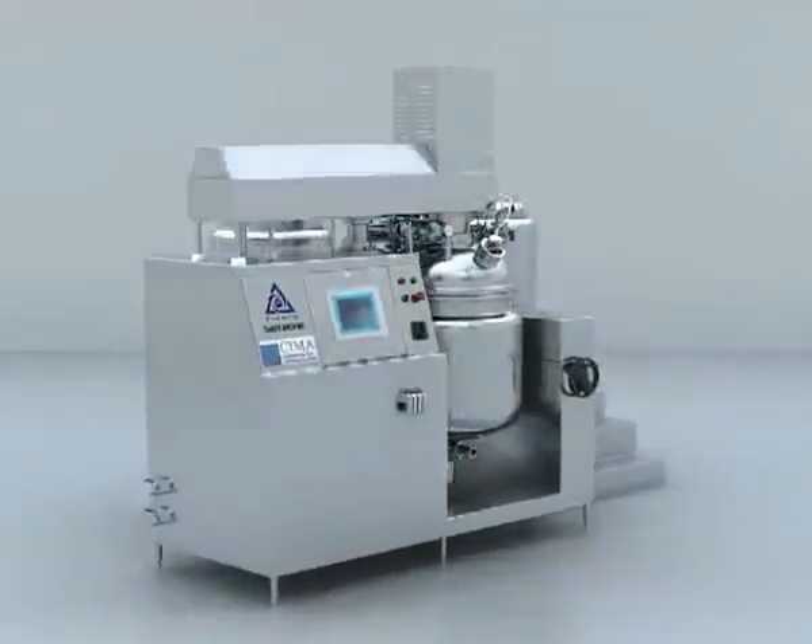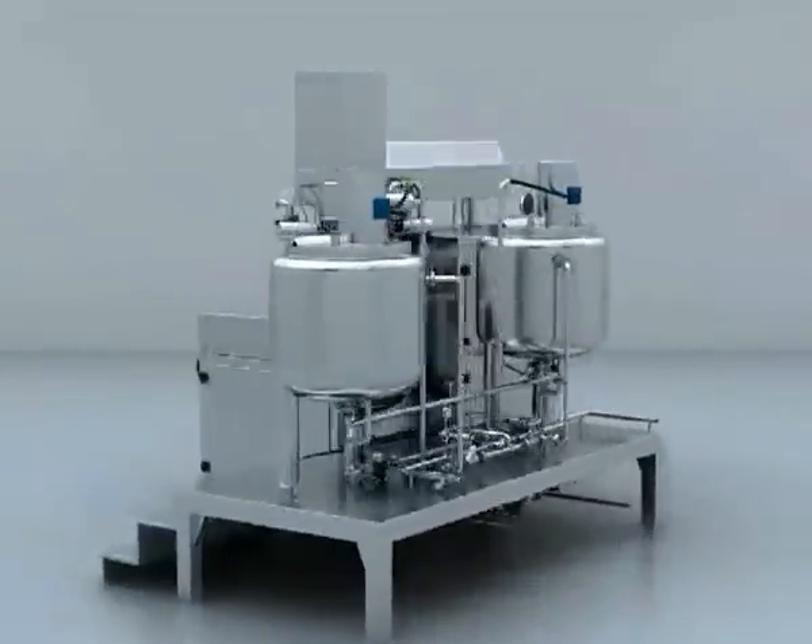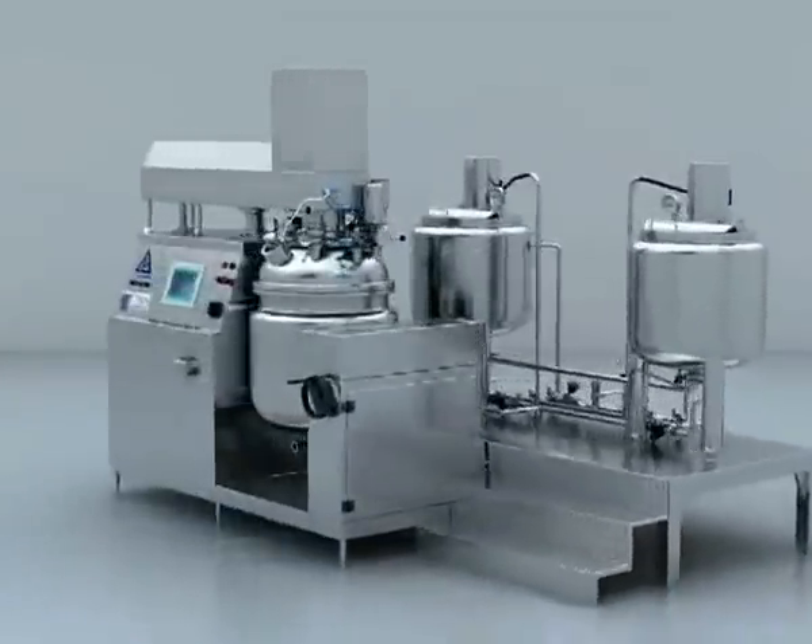The material is made from SUS316L material. The mirror finish of the inside surface is 300 mesh.